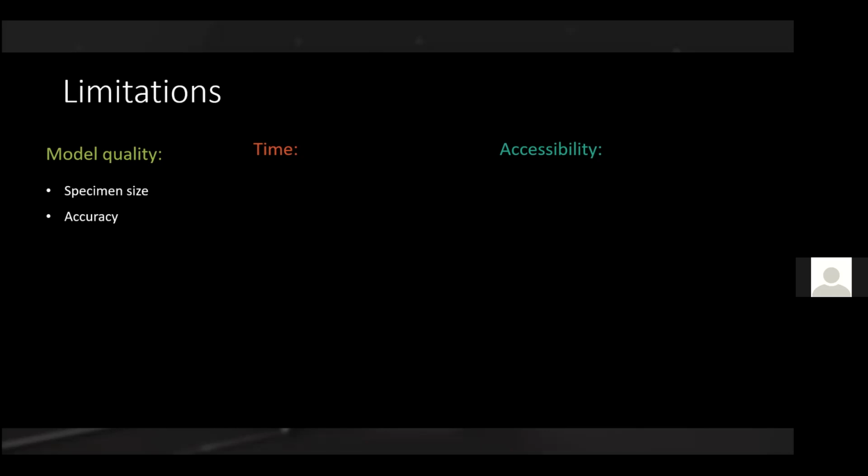That applies if the structures are relatively bulky and this is a height difference that we can resolve. Whether we would necessarily say that we can reconstruct every single 10 micron structure is a different question, because it also depends on the number of pixels that belong to these structures. So it's relatively difficult to give a good number on accuracy for these models. We're still thinking about how we could best do this, because of course it's important, but the best thing that we could come up with in terms of the publication we put out was this reconstruction of these gauge blocks.